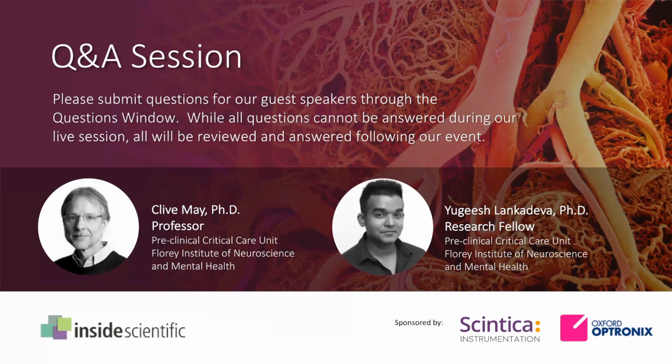That's interesting. I guess Mike, you're not reading continuously during those 1, 2, or up to 3 weeks. Presumably you connect the sensor from time to time to make time point measurements. Is that right? We do continuous measurements for about 56 hours in the conscious animal. But the important thing to understand is that the monitors do allow you to change the acquisition time. If you were acquiring one every second, then of course the probes won't last as long. But if you were to acquire data 1 in every minute or 1 in every 5 minutes, it allows you to do these long-term measurements, which is quite useful with these long-term studies.